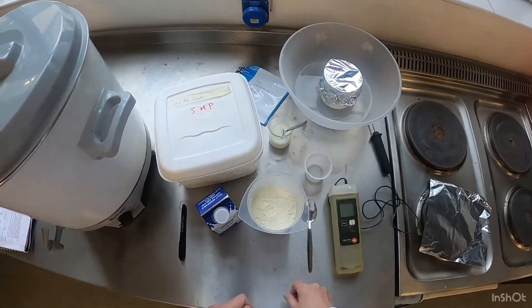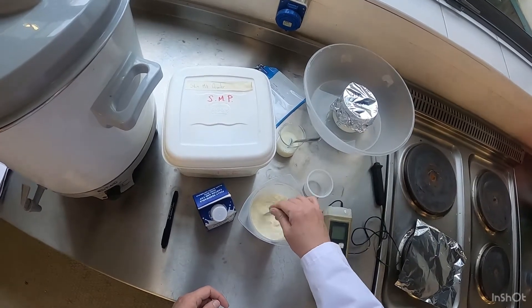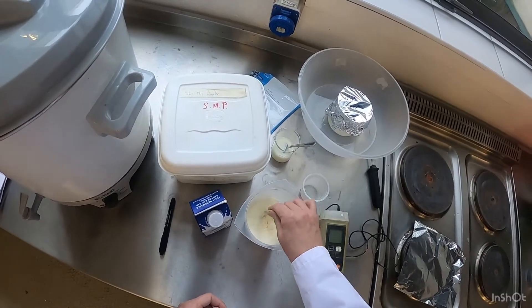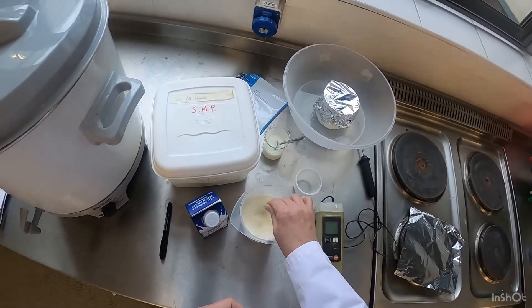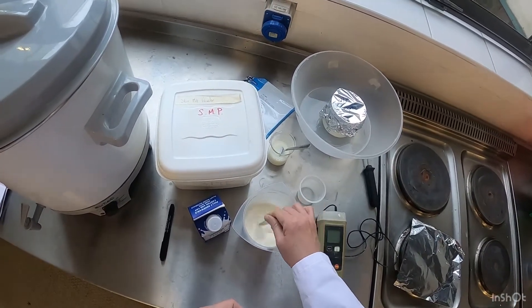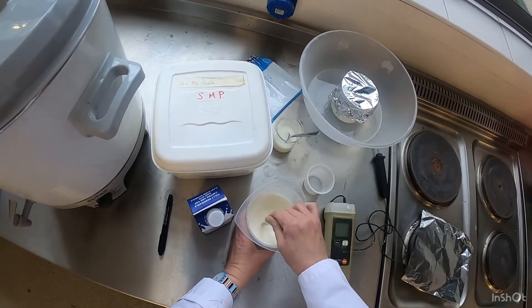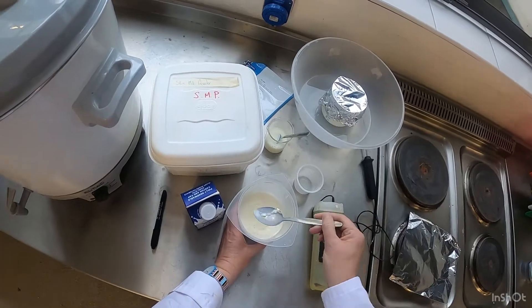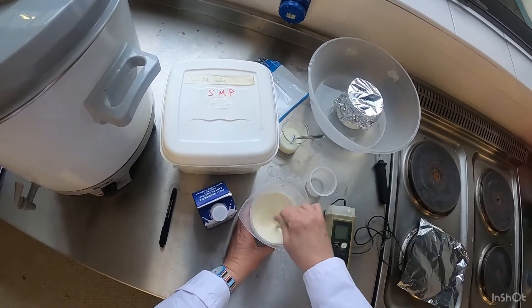We're going to mix it like this, but this mixing is not good enough — we need to mix it a bit better, maybe with a hand blender. It is mixing a bit because I have the temperature of the milk nice and warm, but you can see there are still some lumps coming through, so we need to get it well mixed.